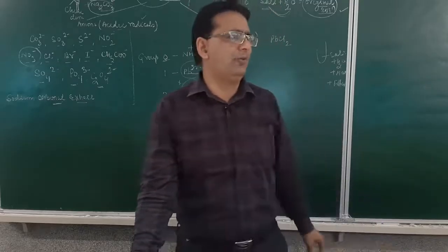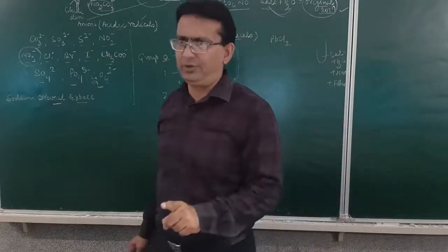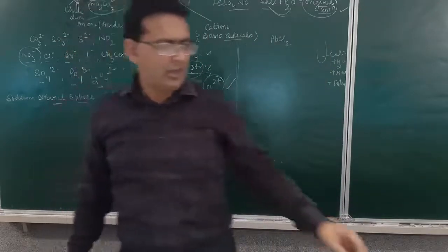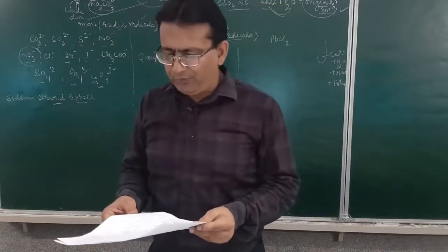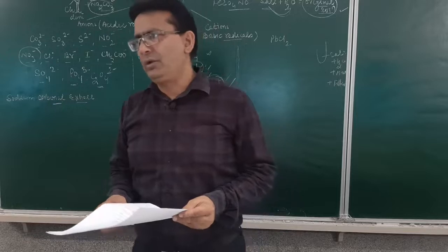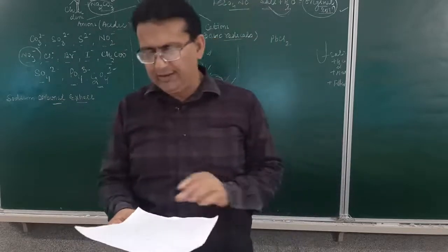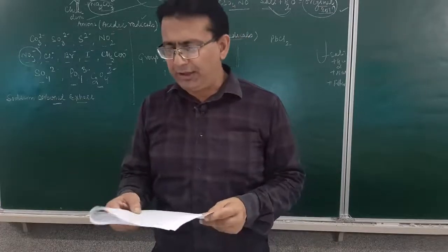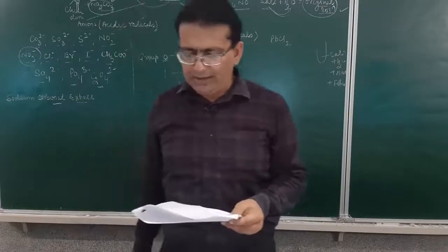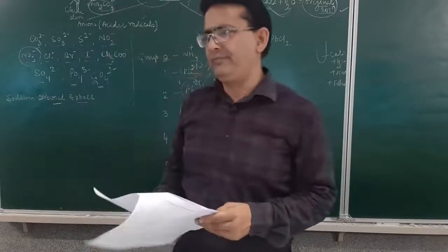Pass the gas through KMnO4 solution, it will decolorize the pink or purple color of the KMnO4 solution. Remember those tests? All the tests are written over here, students. Carbonate, sulfite, sulfide. In this case, H2S gas will be given out, which again will be a rotten egg smelling gas. Then nitrite, you may look at the next page. Then the test of nitrate, chloride, bromide, iodide, acetate, oxalate, sulfate and the phosphate anion.